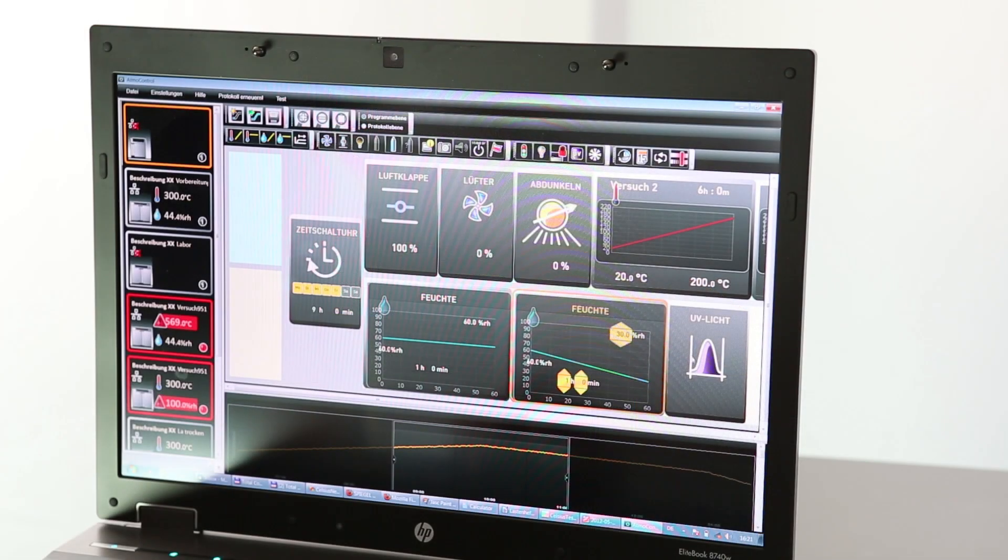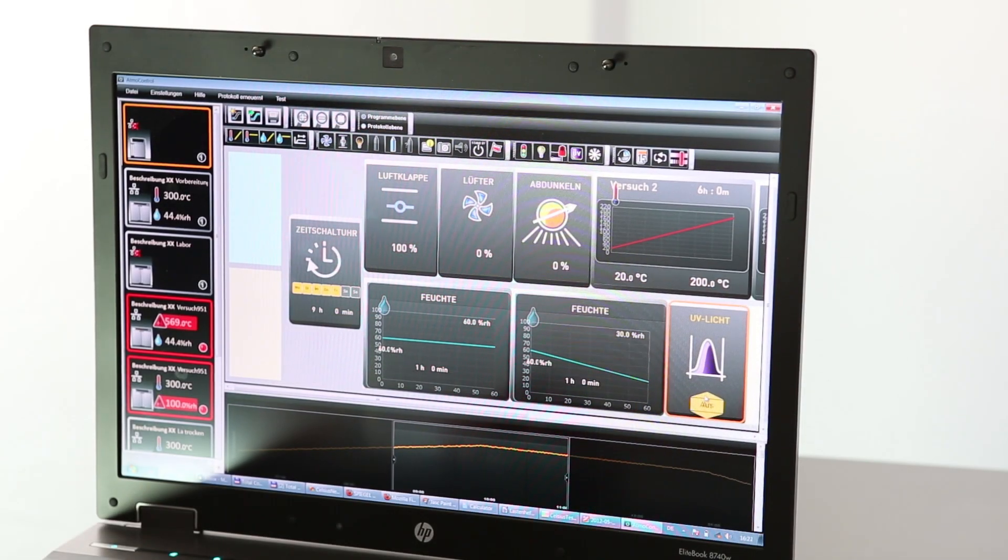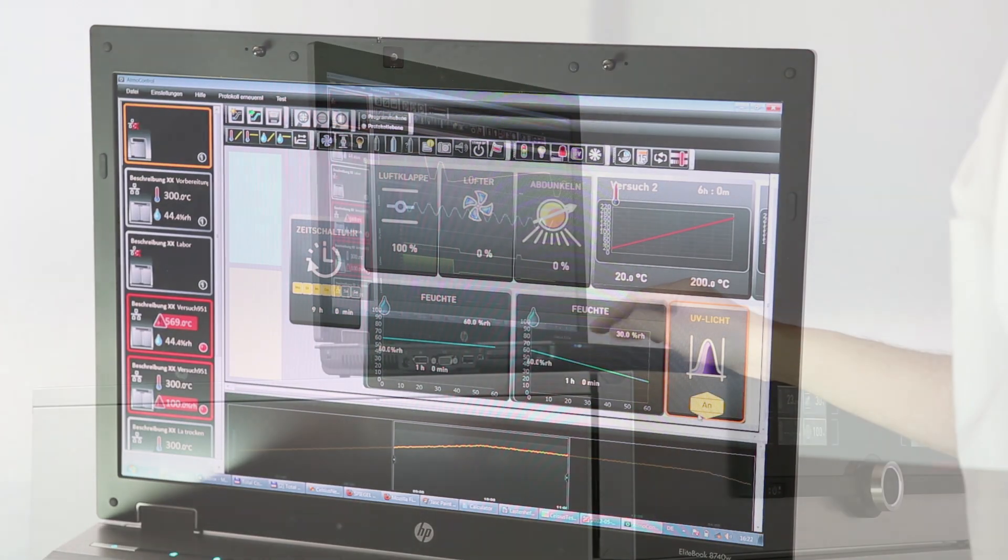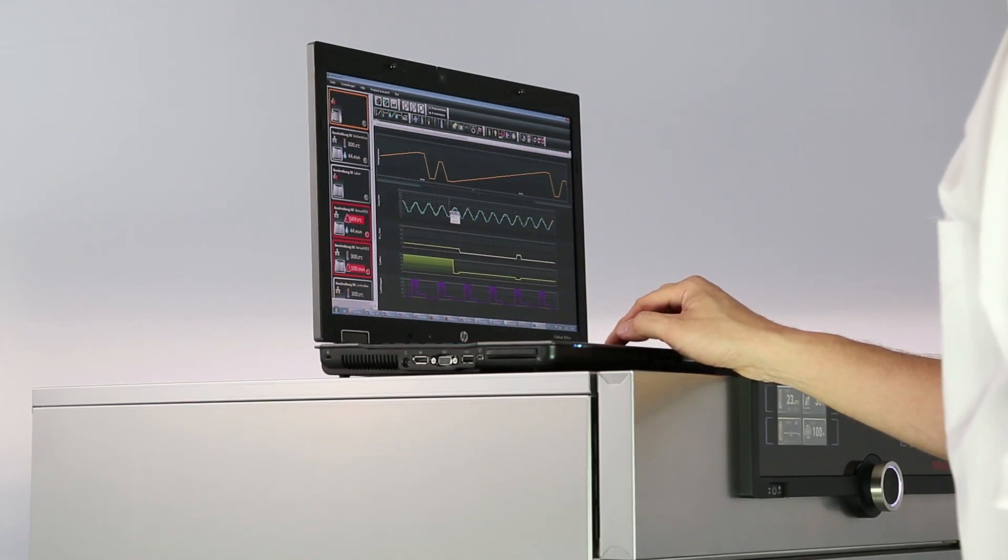That's the motto of generation 2012 appliances. And it is also true for the control and logging software AtmoControl, which features a completely new and intuitive interface.